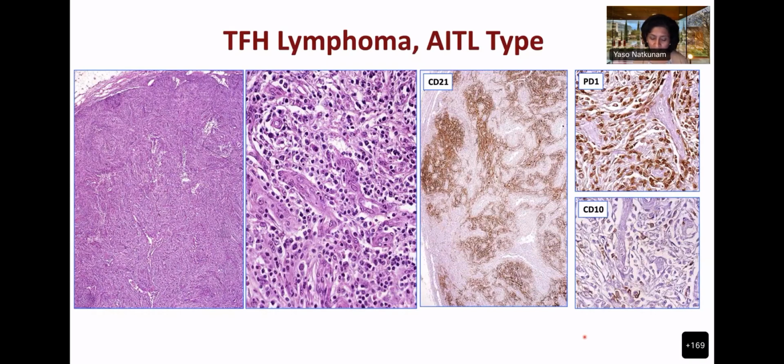And by the way, the double negative T cell population I showed for the ALPS case can also be seen in T cell lymphomas. Usually by flow cytometry, you can also pick up other abnormalities like CD3 loss or CD2 loss. This case had beautiful CD3, but you can also see flow immunophenotypic abnormalities that can be very helpful. And now we know that T cell gene rearrangement can be done, and mutational profiling. There are many nice mutations described like RHOA and IDH2, DNMT3A. So if you do molecular profiling, those can also be picked up and confirm the diagnosis.